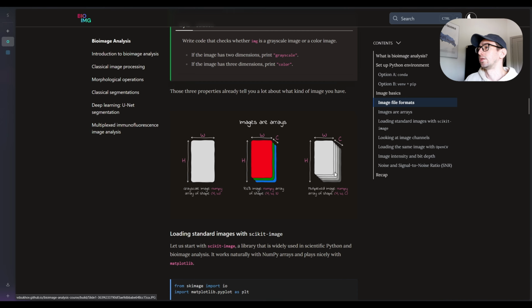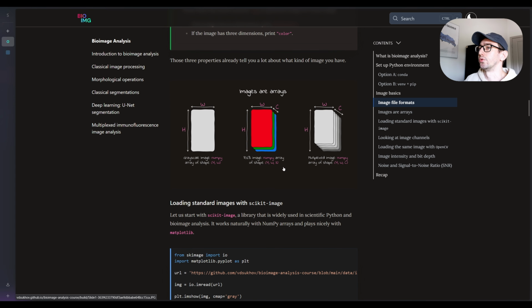And in bioimages, for example, when we work with spatial proteomics data, we will see that there are even more channels. It's not just 3 channels, it can be 20, 30, 50 or something like that. The idea is that we will mostly be working in the beginning with a single channel, and then we will learn how to apply it, for example, to the colored image, or to apply it sequentially for each color array that we have.